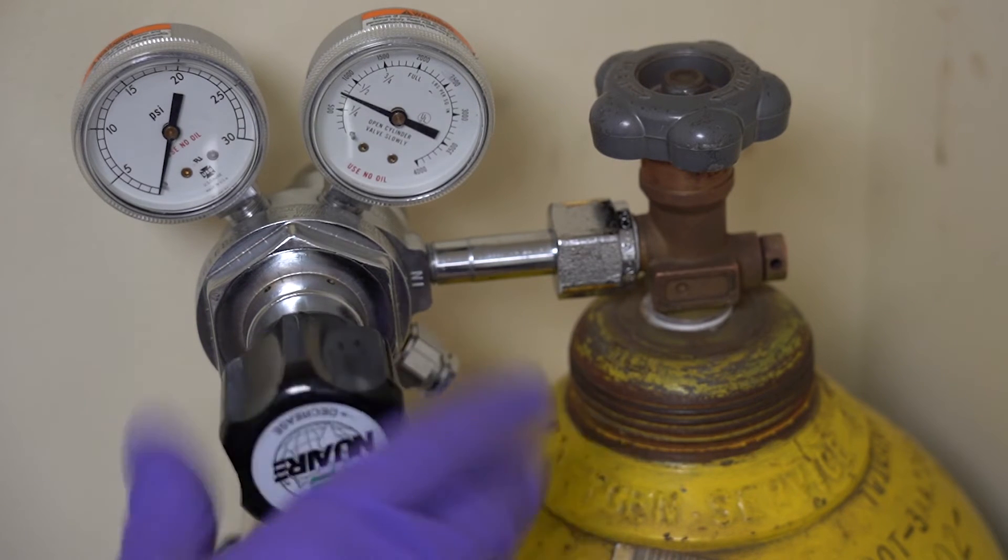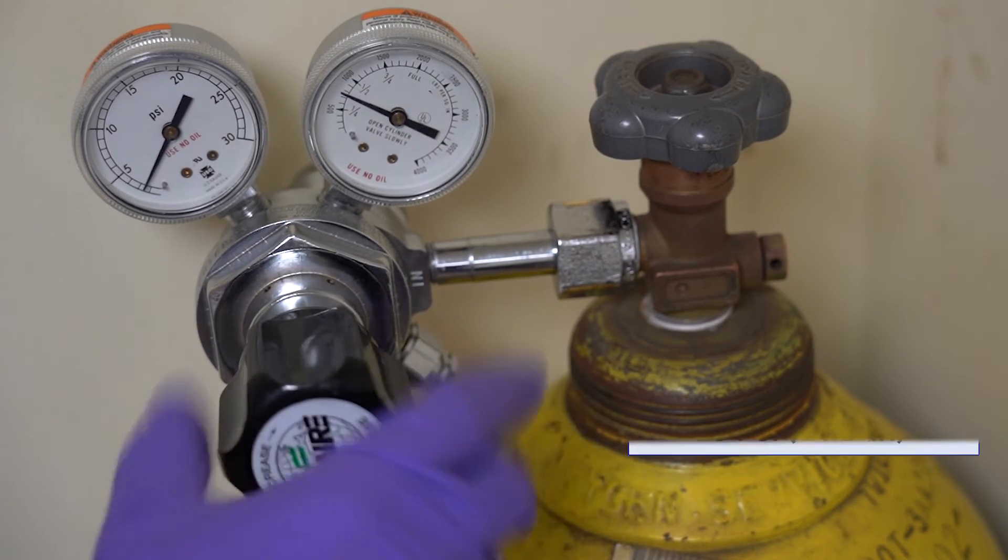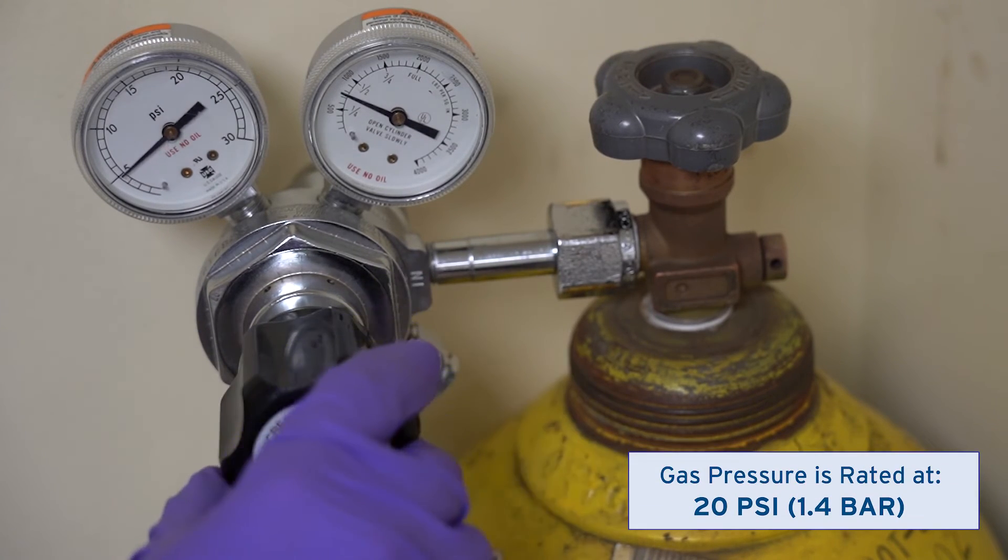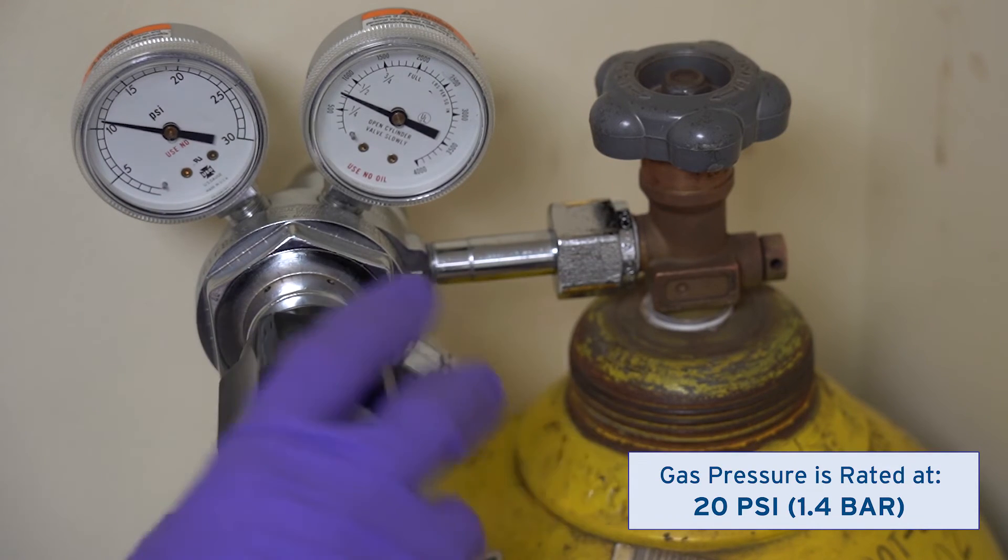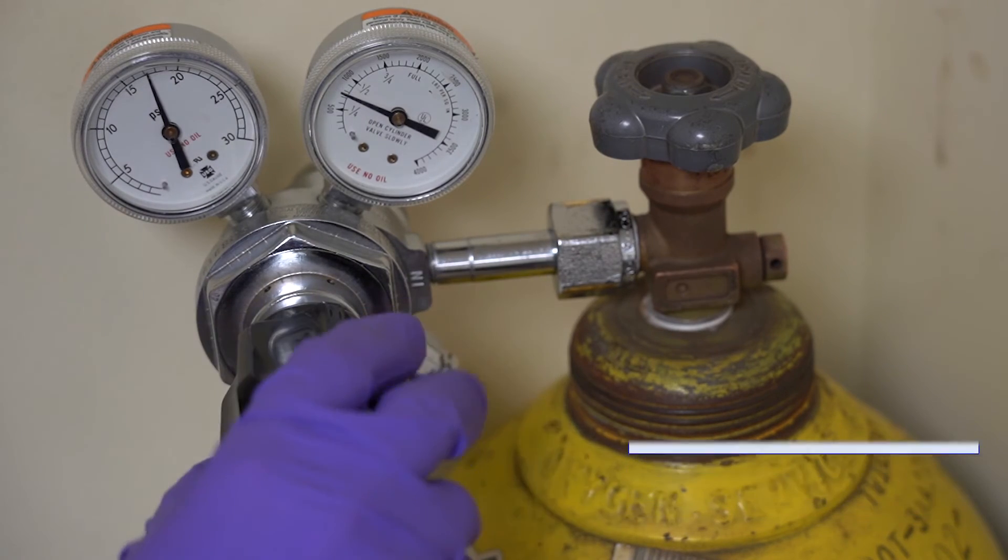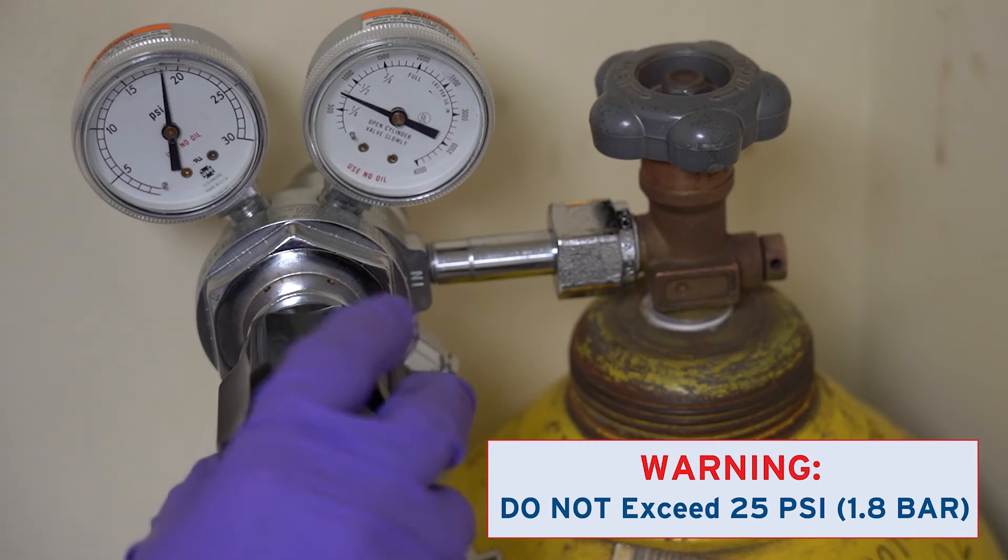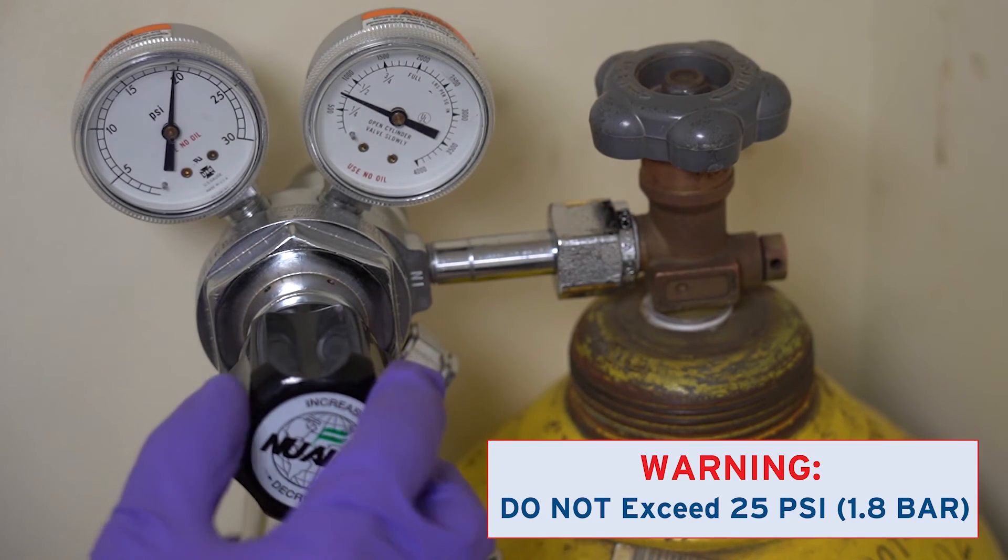Open the CO2 regulator by turning the knob clockwise. Watch the gauge on the low-pressure side of the regulator increase as you turn. Continue until it reads 20 psi or 1.4 bar and then stop. Make sure you do not exceed 25 psi or 1.8 bar.